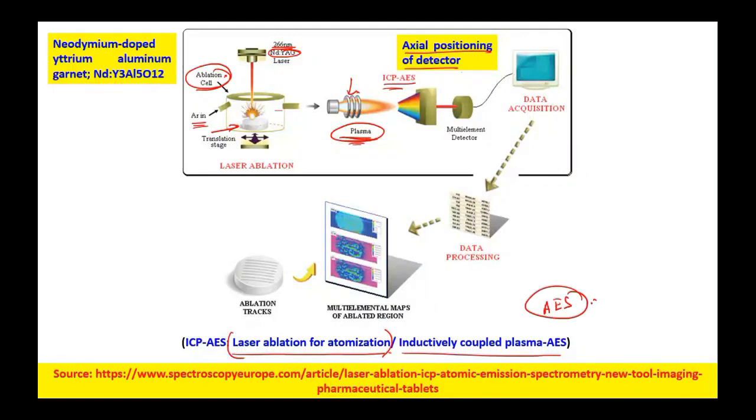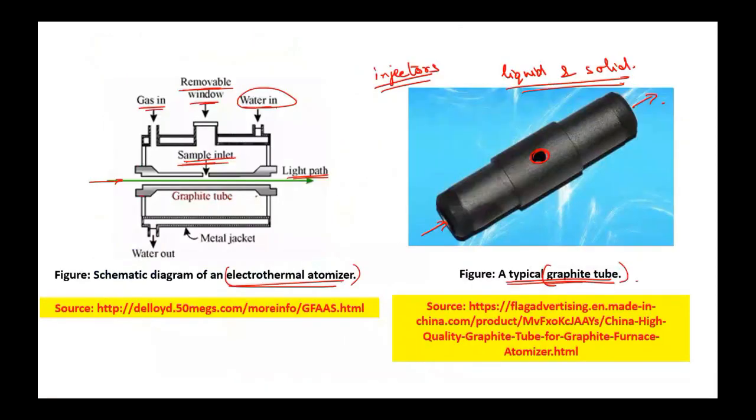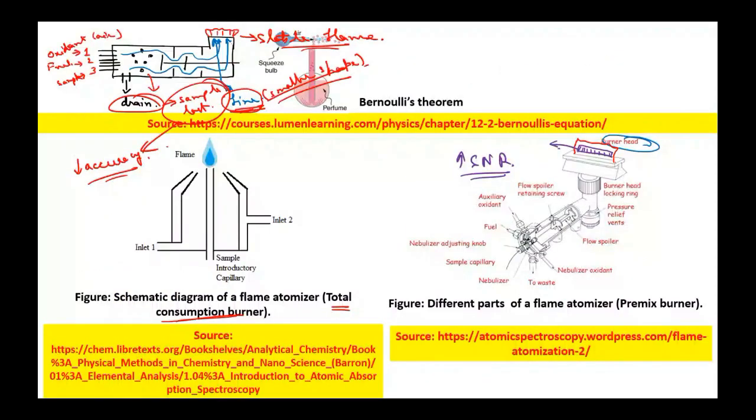As I told you before also, using this flame technique, you can go for either atomic emission spectroscopy or atomic absorption spectroscopy.